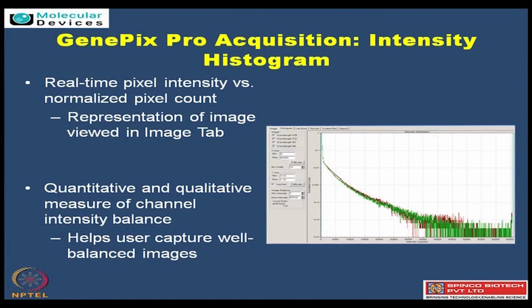After a little lag of a few seconds, you want them to overlap. Then you can select whether this PMT is good for you. This is how you check which PMT is more suitable: you select a PMT, look at the overlap, and wherever there is the best overlap without saturation, you go with those settings.